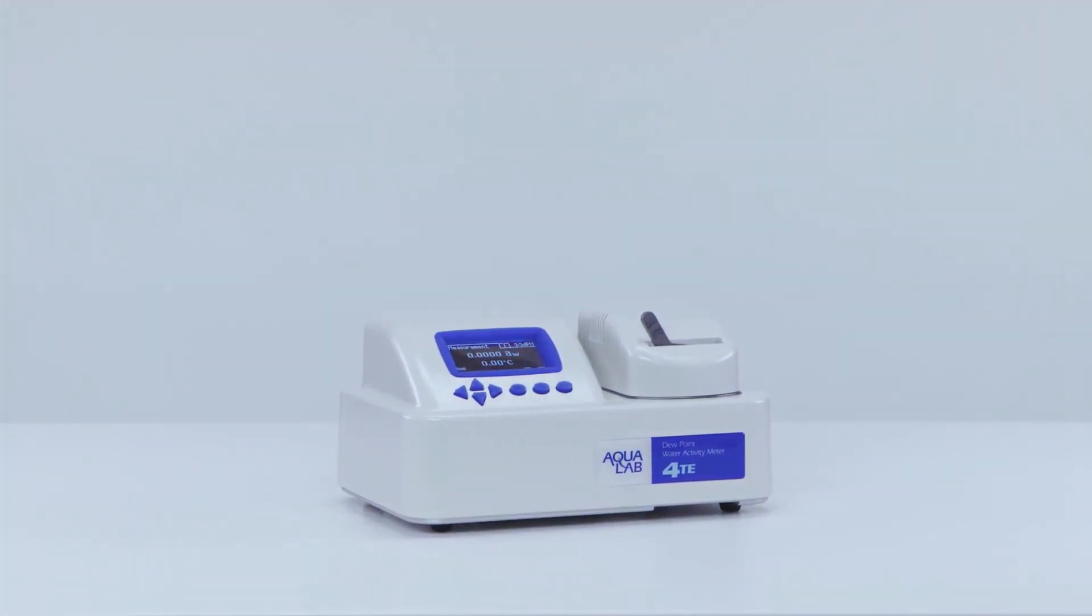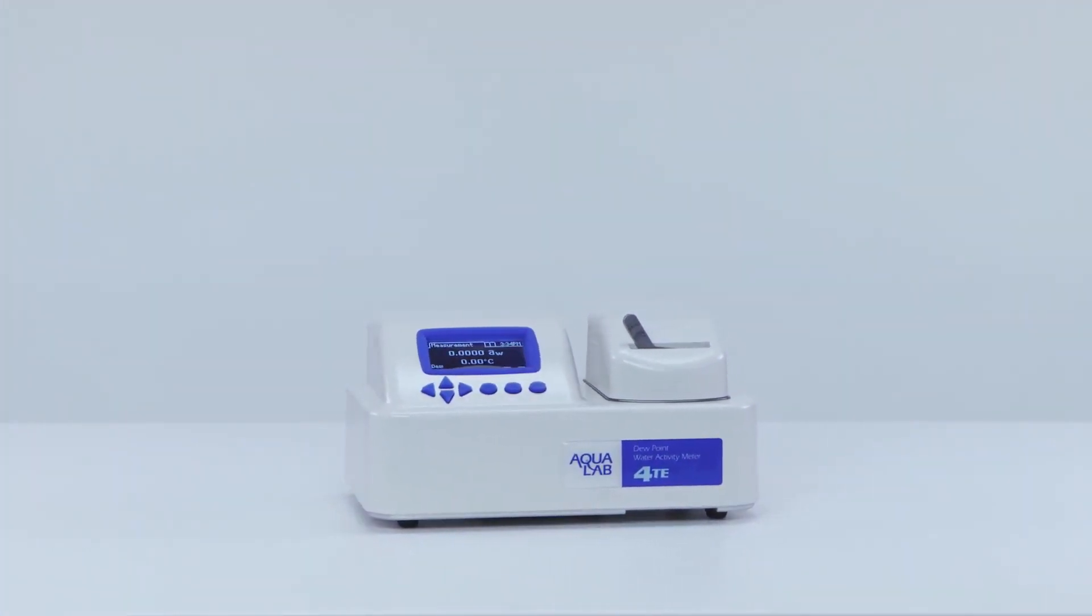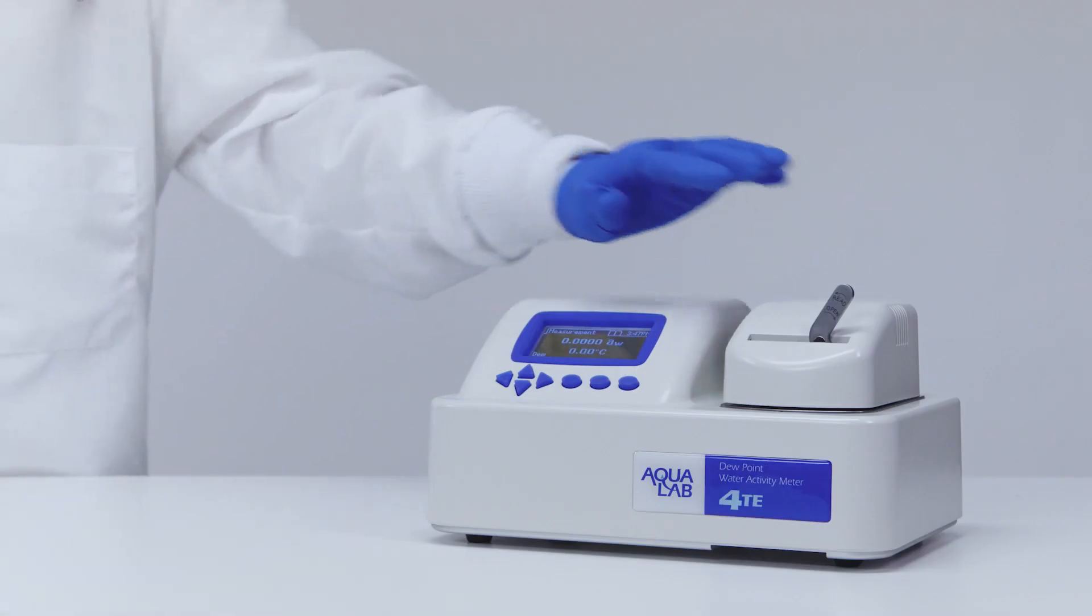It's the fastest, most accurate way to measure water activity in foods and pharmaceuticals. Here's how it works.